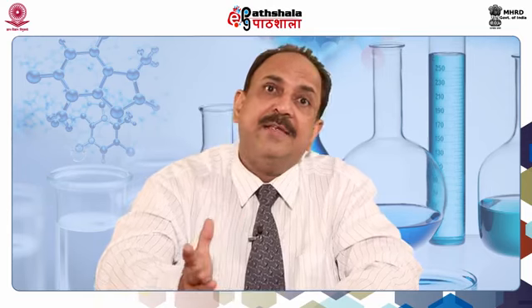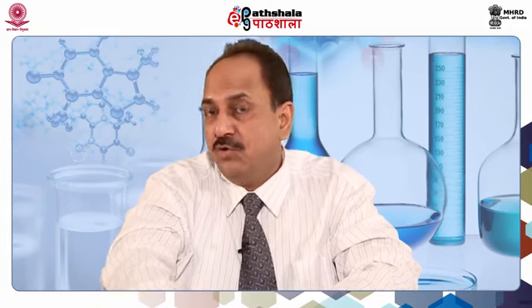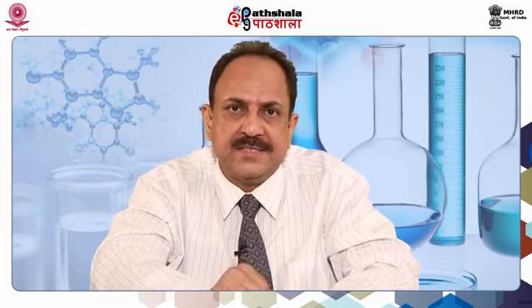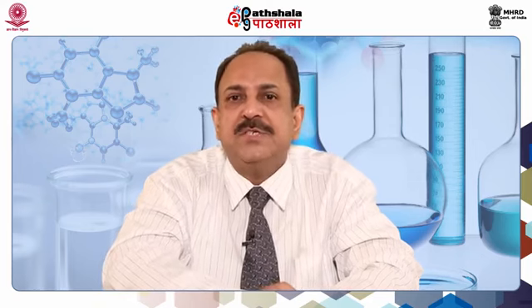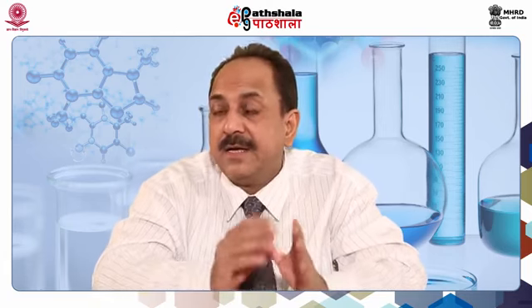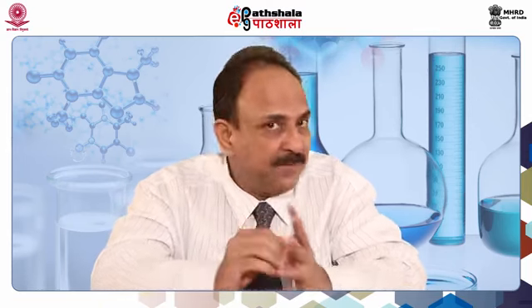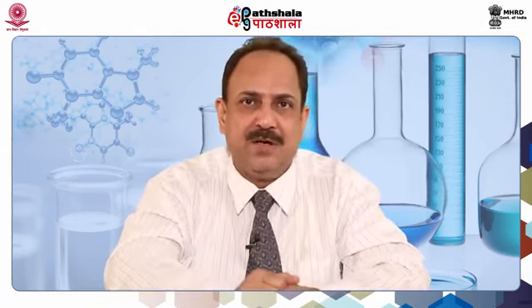A PDB file can be opened with any structure analysis software, and we will be using the SwissPDBViewer, which is available freely from the Swiss Institute of Bioinformatics at the ExPASy server. Therefore, we will use SwissPDBViewer because it is freely available and it is highly capable of structure analysis. Most importantly, it allows the visualization of the enzyme or the protein molecule in three-dimensional stereo vision. That is, we are able to see the depth of the molecule.